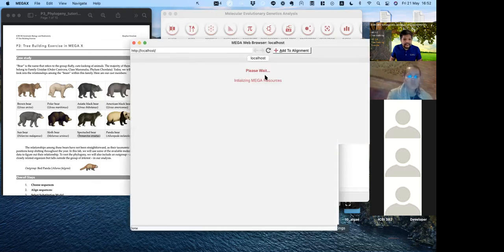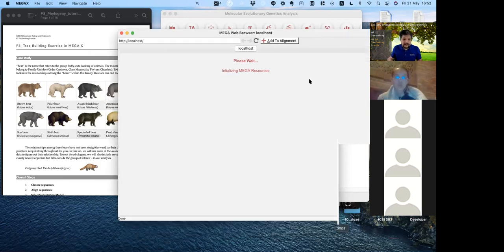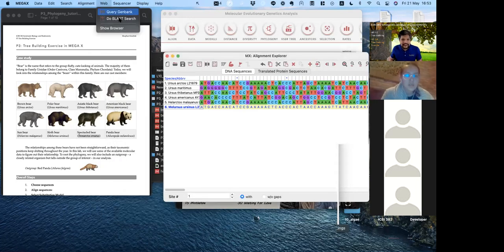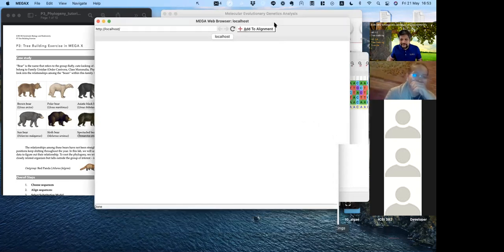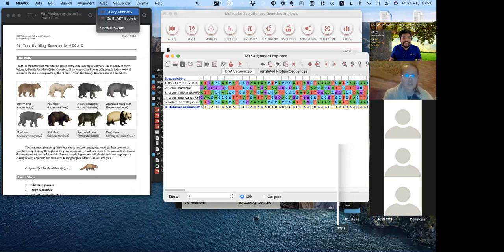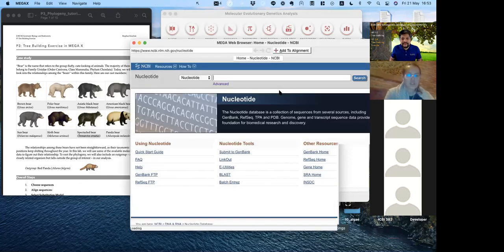My browser keeps crashing on me. If you have the same problem as mine, you can just close the browser and open a new one. Some of you can go back to using the same browser, it is completely okay. Good God, how embarrassing. I'm not talking about you guys, I'm talking about the program, sorry. If you hear any swear words, it's not for you, it's for this. See? This happens from time to time.